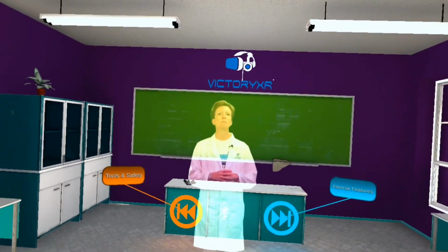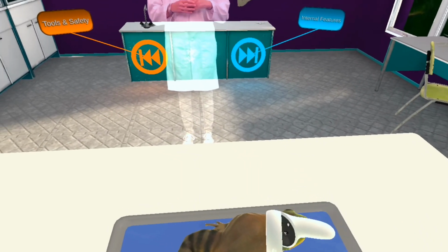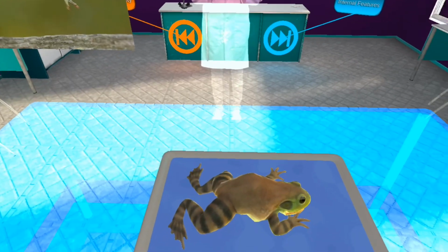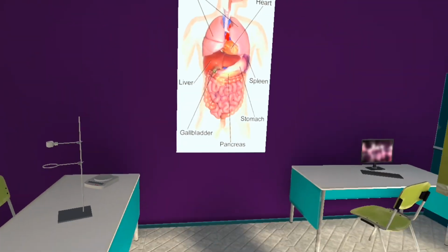Okay, go ahead and put the frog back on its belly. Frogs have 4 appendages: 2 forelimbs, or front limbs, and 2 muscular hind limbs for jumping. Lift the front legs with the forceps. Their front legs are short and specially designed to absorb the impact of landing.